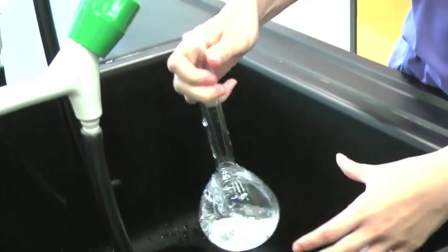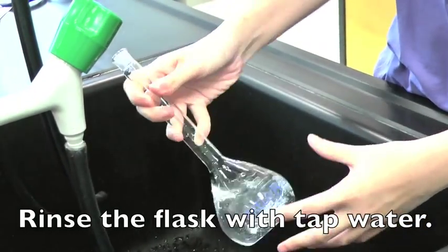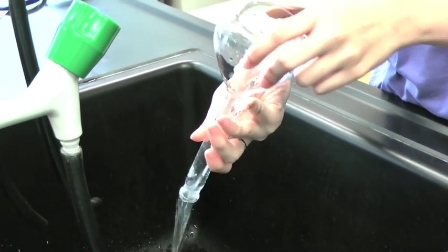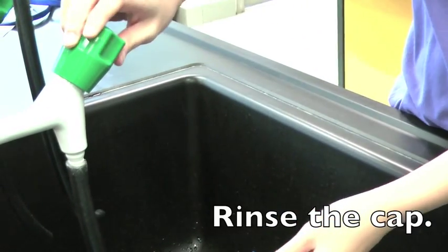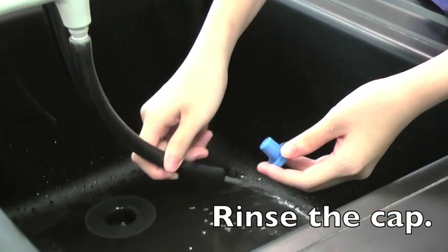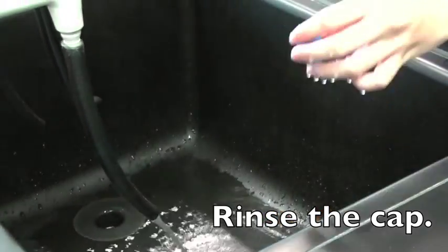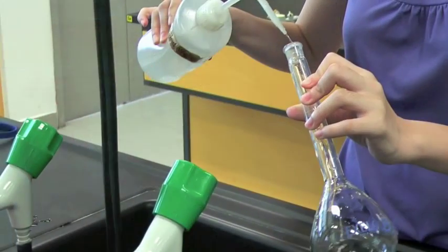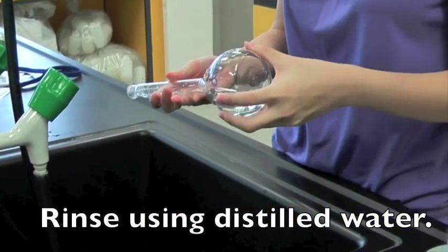To rinse the flask, first use tap water. Rinse the cap thoroughly with tap water. Next, repeat the same steps now using distilled water.